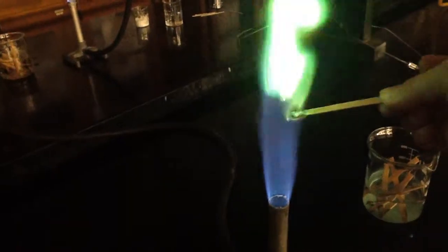Our next chemical is copper — Cu. We're going to do that same procedure where we dip the stick, get the chemical on the stick, and put it in the flame. This one definitely we would say like bright green. We're going to put that in the water.